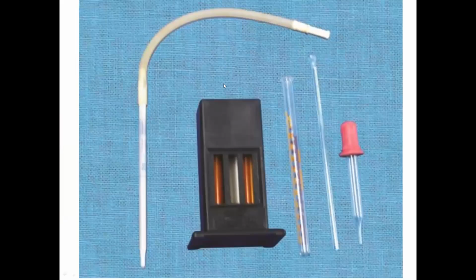Here we are going to keep our graduated tube. So these 3 colors should match. We will look at it a little higher, in the light. If it is perfectly matching, then, can you see the graduated tube apparatus slide? Yes, can you see? Yes, ma'am. All right. So you have to compare it. If it is matching properly, immediately you will show the result to the examiner.